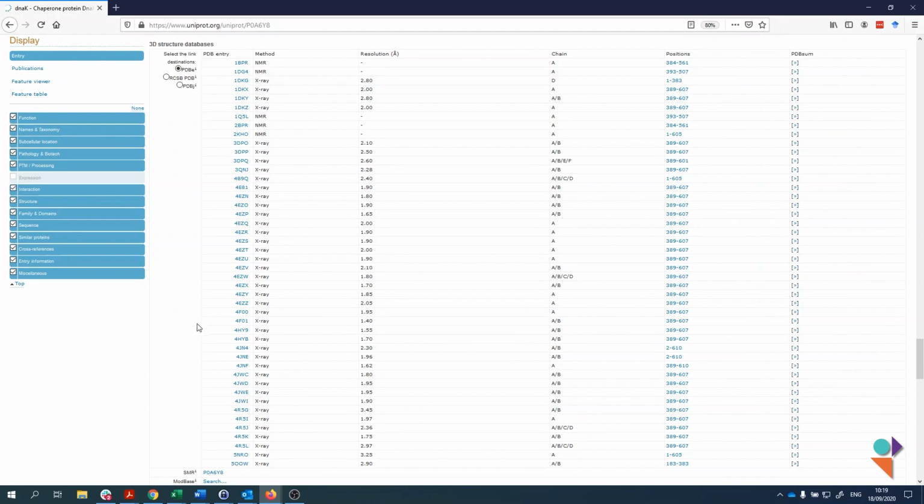This in itself is of course already a rather difficult exercise. How would you filter out the structure which you prefer or which you want to investigate further? Unfortunately, there is no magic bullet solution. One option would be to look at all of them, but if we're talking about so many, this will take a lot of time. Sometimes, however, this is a necessary evil, as it is not easy to find those structures you would like to look at.